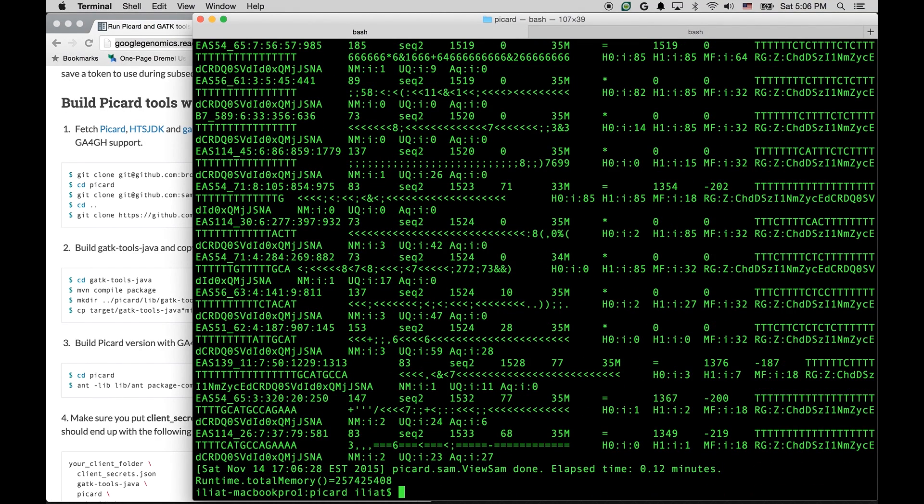Okay, this worked. We have run a standard Picard tool, but the input came directly from the cloud as opposed to file.